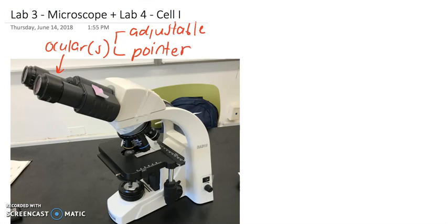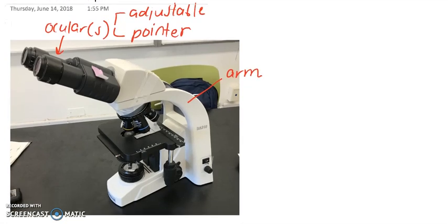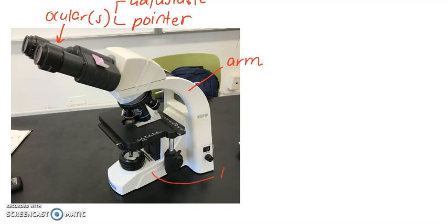Next we have the arm of the microscope, right here. And down here at the base, we aptly call this the base of the microscope. Whenever you carry a microscope, one hand on the arm and the other under the base. Okay, this rotating piece right here, these are the objectives. So here is the yellow objective, here is the blue objective. Below it, where you place the slide, we call this the stage. So this is the stage.